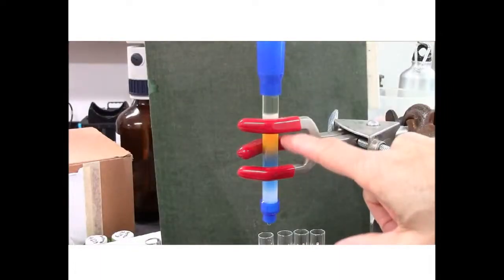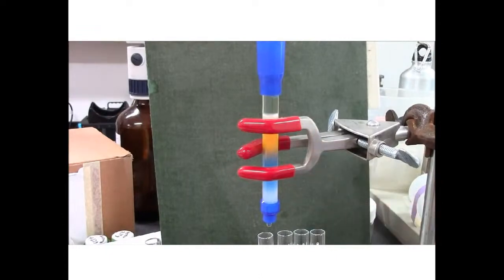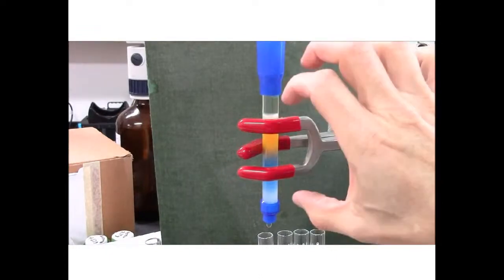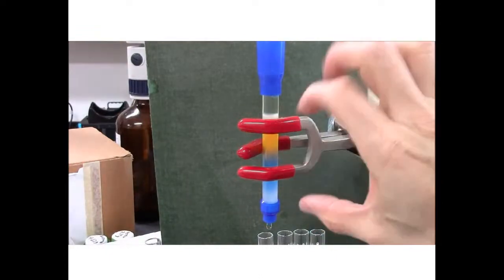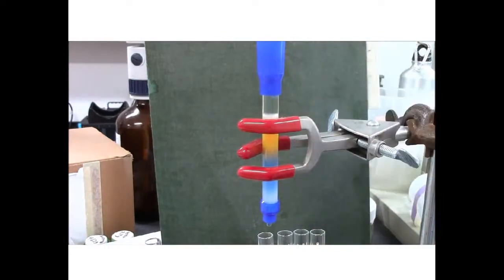The yellow molecules are up here, the blue are down here. Still got a little overlap. So I may have overloaded this column, but we'll see. I'm hoping that before the blue molecules elute they'll actually be separated from the yellow, but it's going to be close.